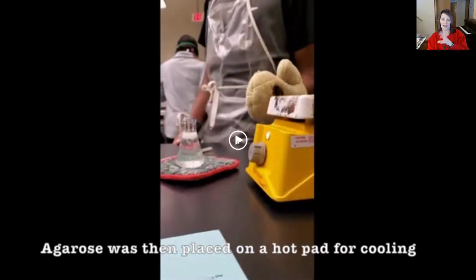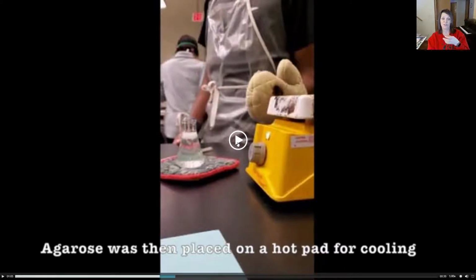You'll notice that as it heats up and gets close to 100 degrees Celsius, boiling over is a thing that we have to make sure that doesn't happen. And you're going to have to be quick with the hot hands, the hot mitts, to get it off of the hot plate onto the lab table to cool.